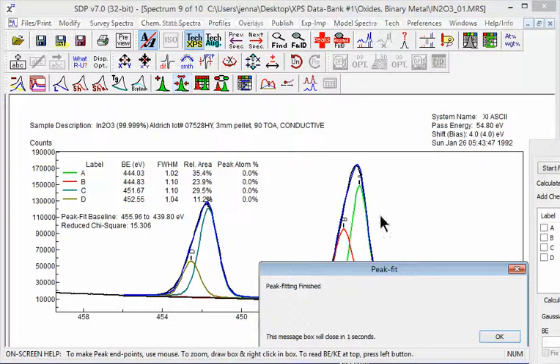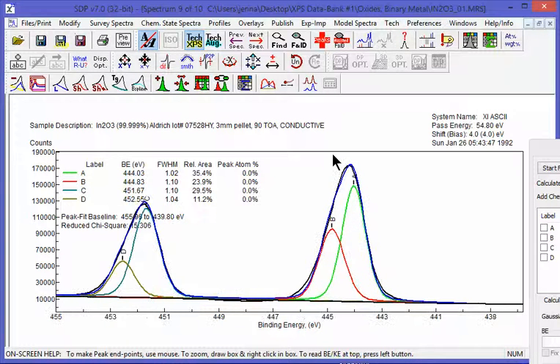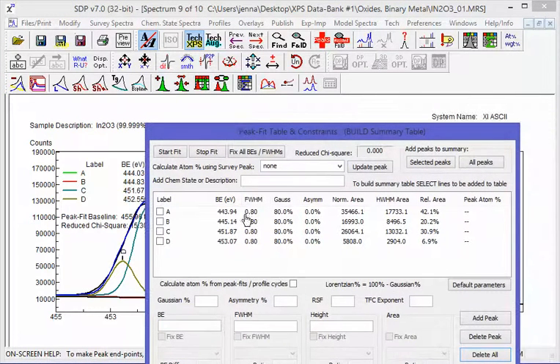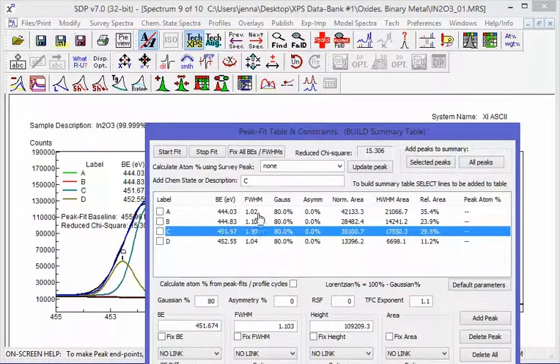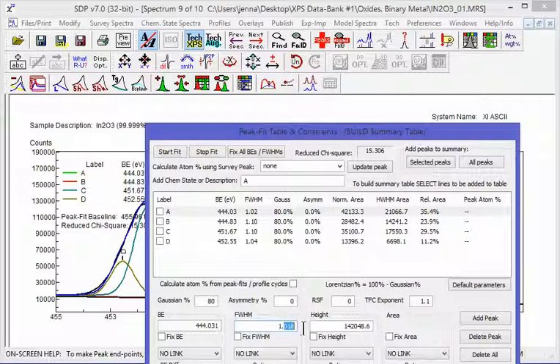It has iterated. The results are a little bit better than before, 24. This large number is most likely due to this inverted baseline aspect here. So we'll leave it alone for the moment. But if you look at this, we have a better fit. It's not an optimized fit. What you might want to do is to go in and make the peaks a little broader and see what they optimize out to be.